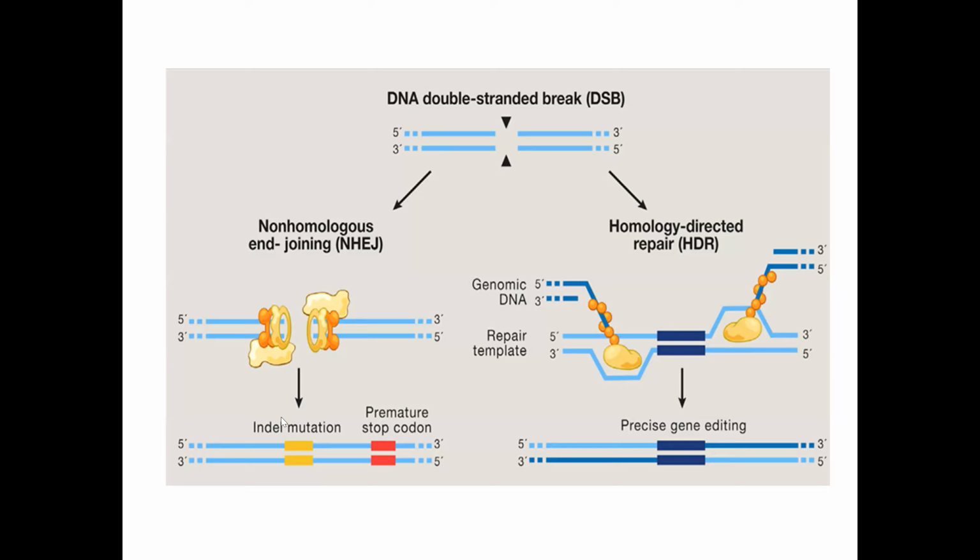Okay, so you can see that from the cut end, some nucleotides can get added during the joining process or ligation process, and some nucleotides sometimes get removed from the cut site. So after patch up, after it's ligated, you will see either insertions or deletions at that original cut site. Okay, so after ligation, you will see this one.